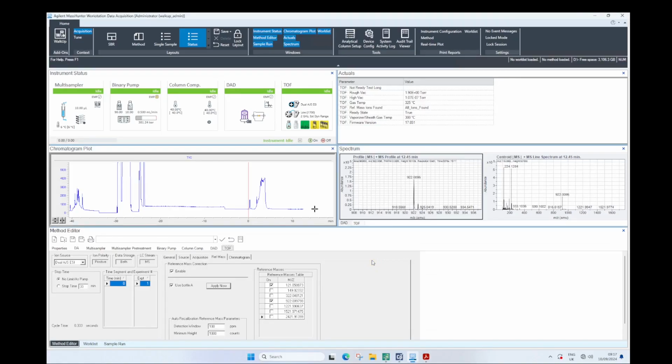I wanted to show you an entire workflow, how we would go about method development, maybe to get good chromatography and detection of a molecule with accurate mass methodology. So at the moment I'm on a time of flight system, and the first thing I want to do is make sure the system is calibrated.